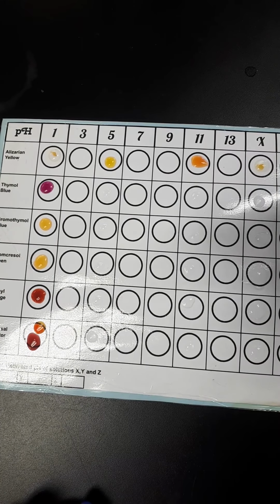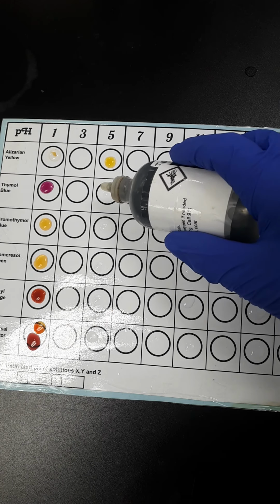So thymol blue in a pH of 5. Let's see, thymol blue, where are you? pH of 5. Should be yellow still. Let's check that one out.